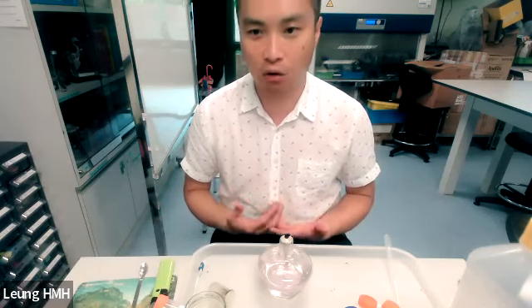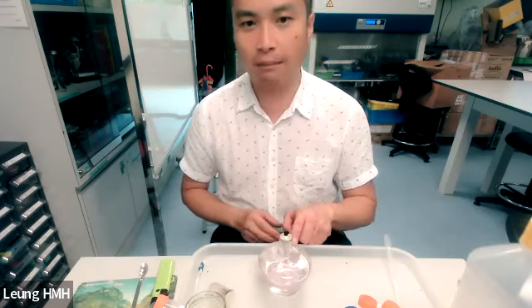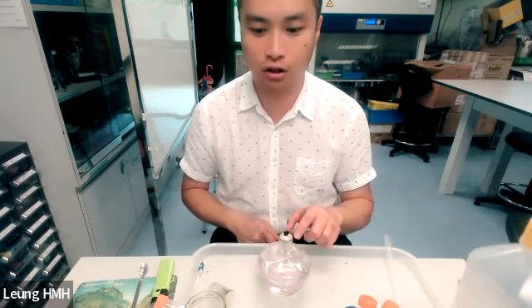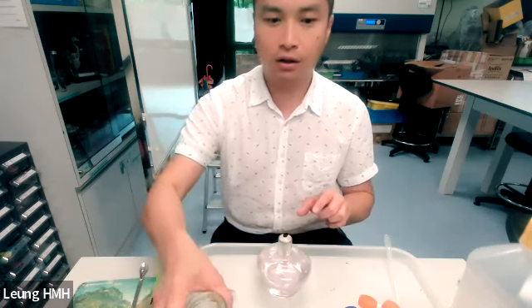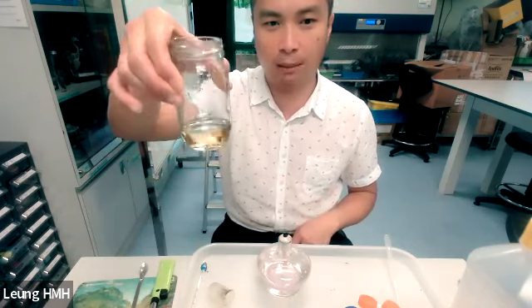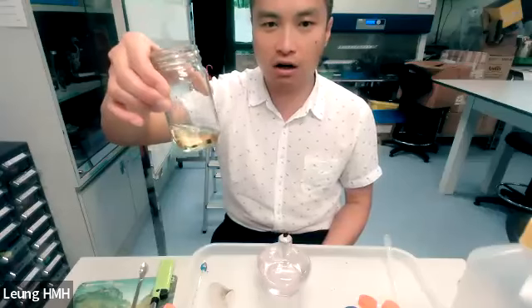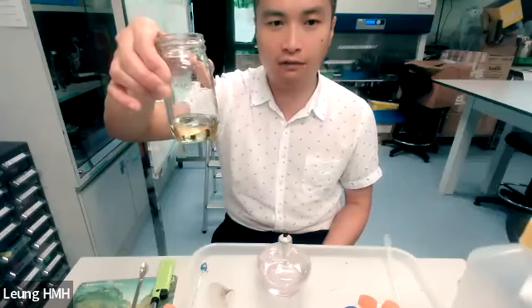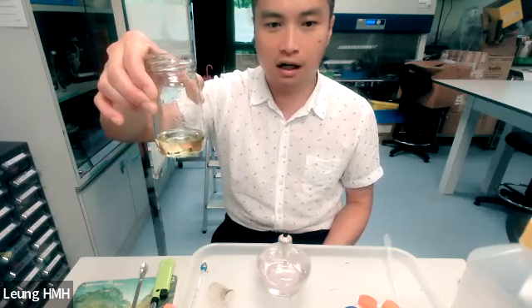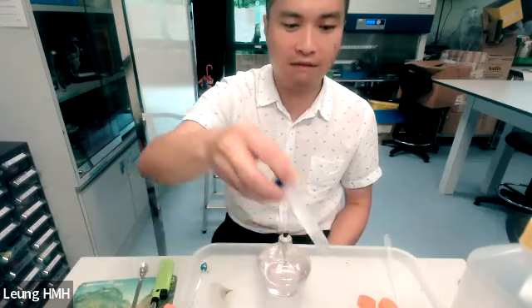Okay, firstly, we try to prepare apparatus and also chemicals for the experiment. Firstly, this is an alcohol lamp. The alcohol lamp is to give heat to the oil. This is the oil, which is plant oil, right? Plant oil, so this is the component of biodiesel, right?